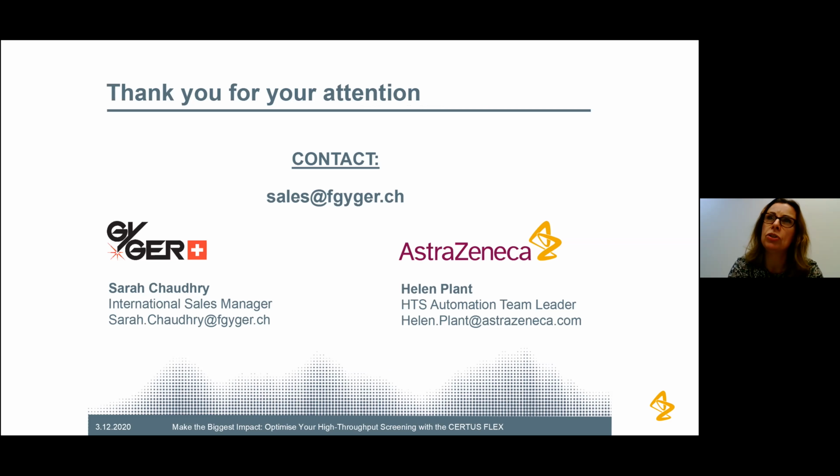And some of our users choose also to use the suction filter cups that can be applied to the end of the tube. I think it's a bit more of a crude filter, but they choose to use those as well. With the number of plates we're running, especially when you're automating it, you don't actually watch the dispensing, which might be taking over 4 or 5 hours. The issue of having a blocked valve and losing it is obviously critical, so we try to minimise that by filtering as much as possible.